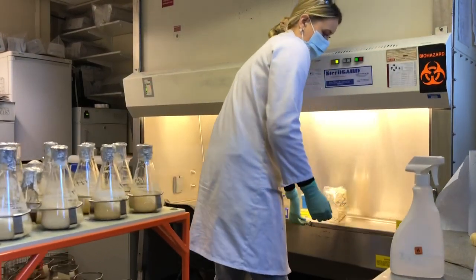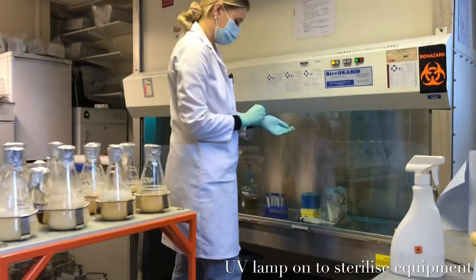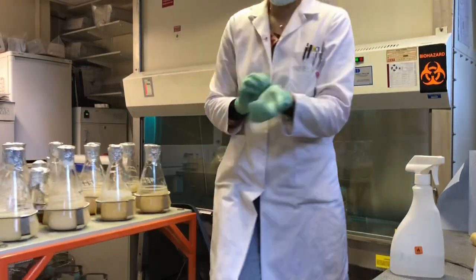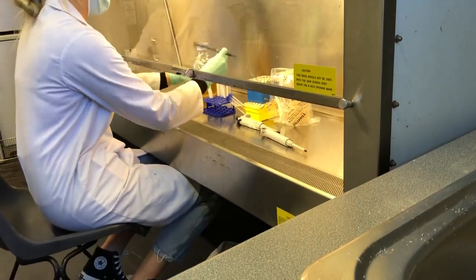Another good step to try and ensure you have as sterile an environment as possible is to use a UV lamp, which will help to sterilize the surfaces and any of the equipment you've brought into the clean hood.